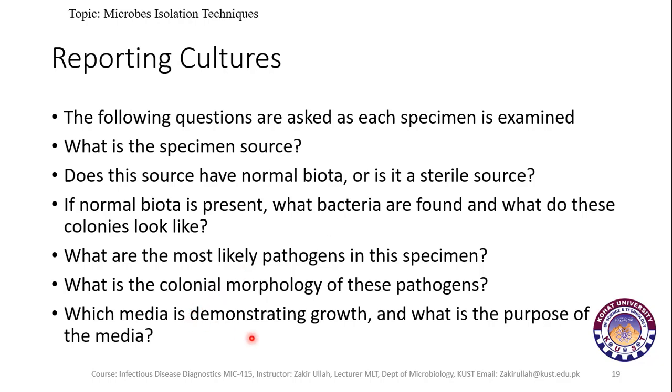Which media is demonstrating growth and what is the purpose of the media? During reporting of cultures, the media on which the organism is grown is also discussed, and why this media is used for culturing this type of microorganism.